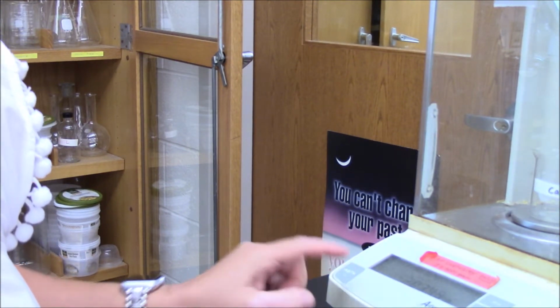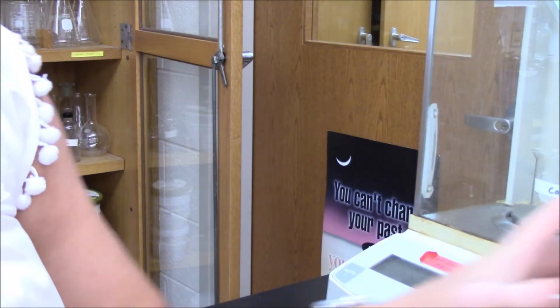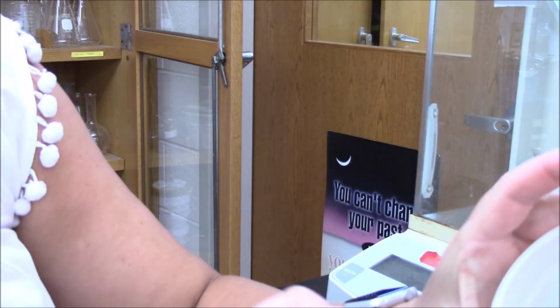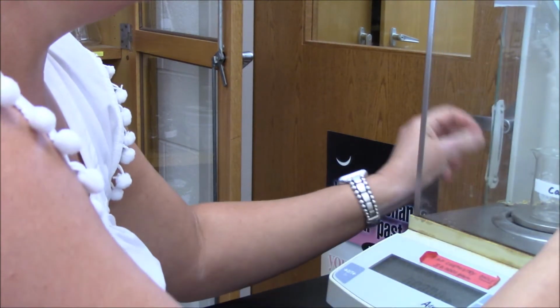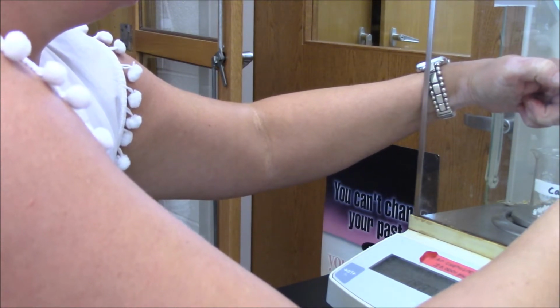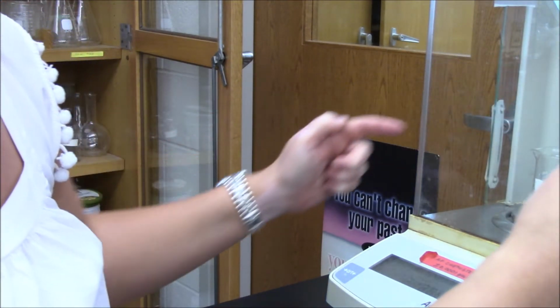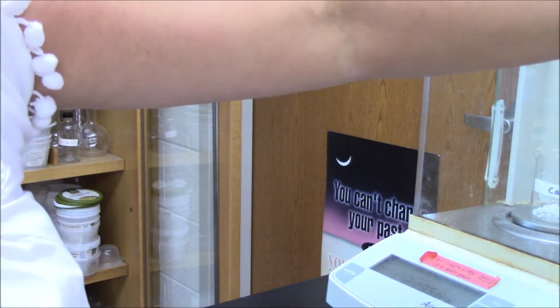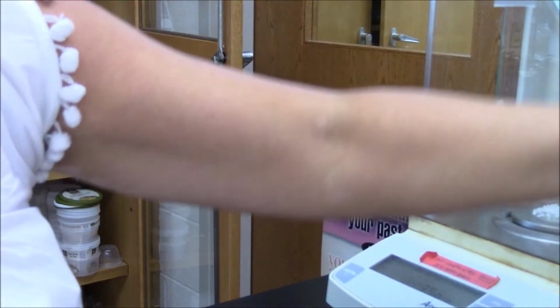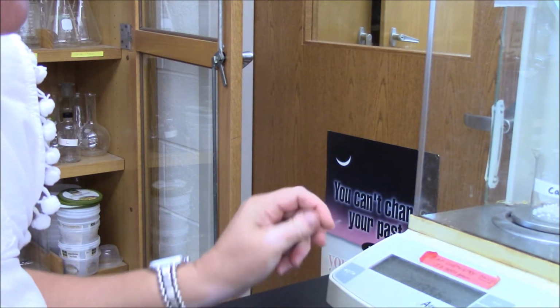I'm going to press tare now that it's stable, and I'm going to add calcium chloride. Again, they say roughly 2 grams. This is a little bit more. This mass is 2.1956 grams. Again, it doesn't really matter because this does not have to be exact.